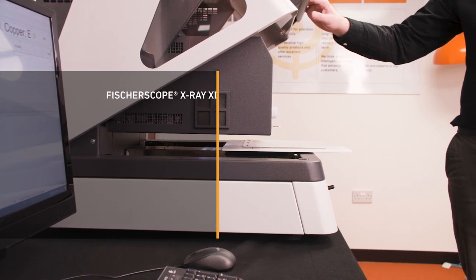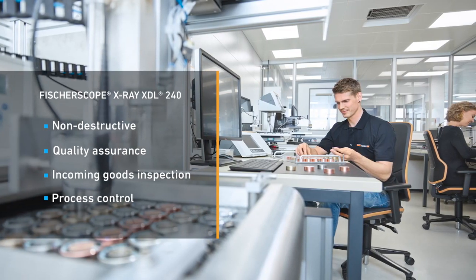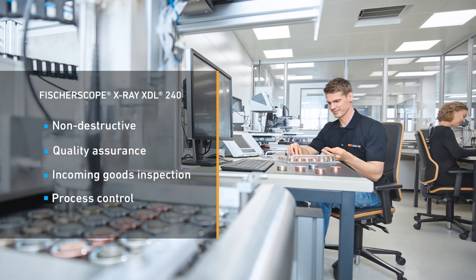So you can make fast, non-destructive measurements. The instrument is well-suited for measurements in quality assurance, incoming goods inspection and process control.